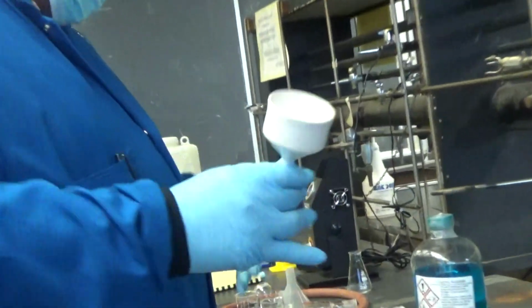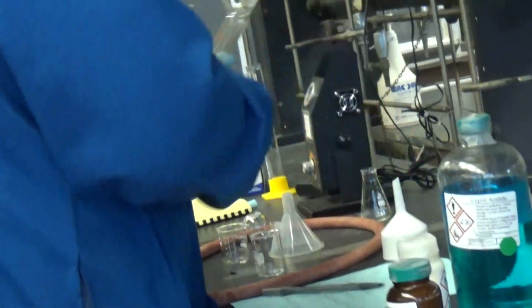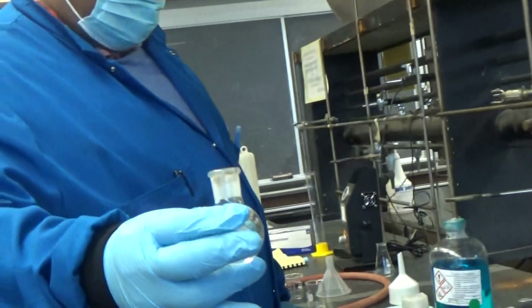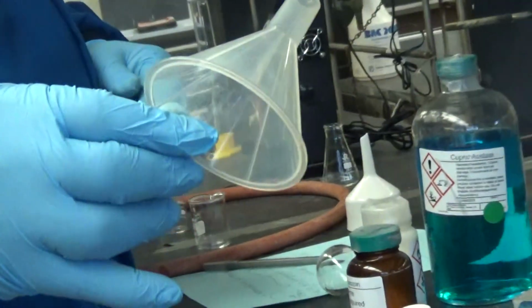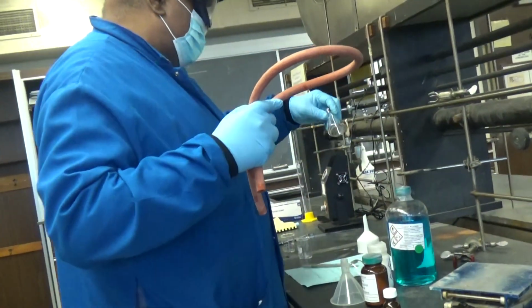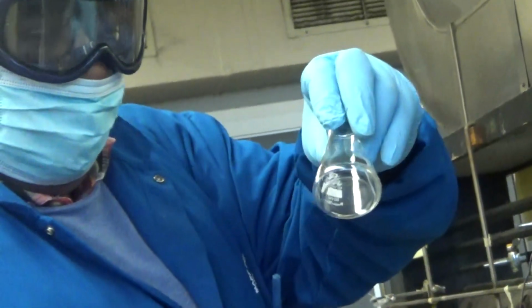We need a Büchner funnel for vacuum filtration. We need a nice big condenser. We need a 50 milliliter round bottom flask for the reaction. We need a big plastic funnel, as you see here. We need a hose. We need a 50 milliliter Erlenmeyer flask, which will be for purification later, for crystallization.